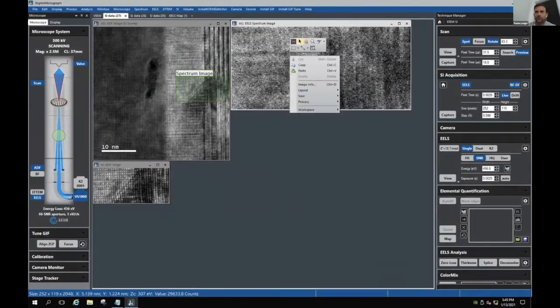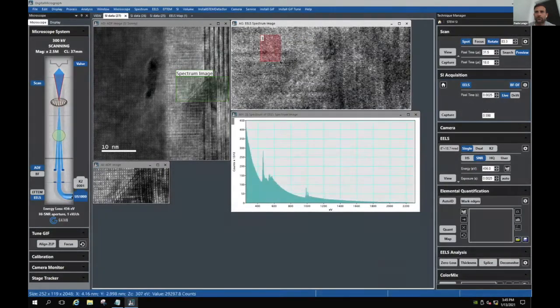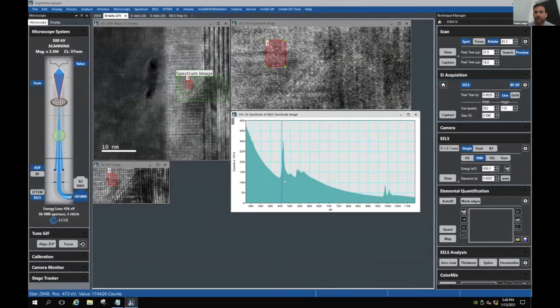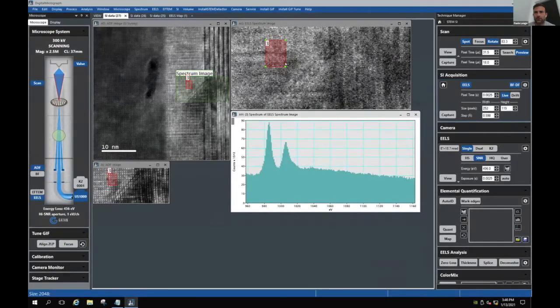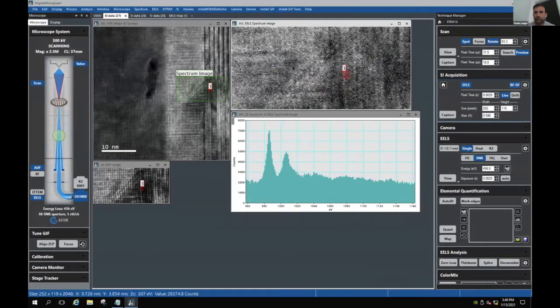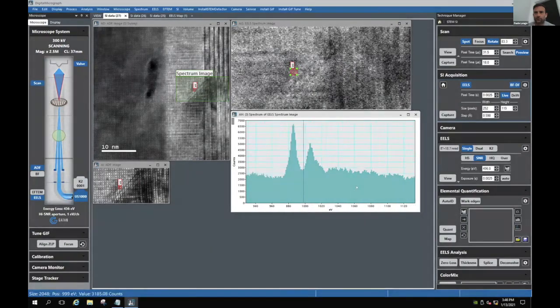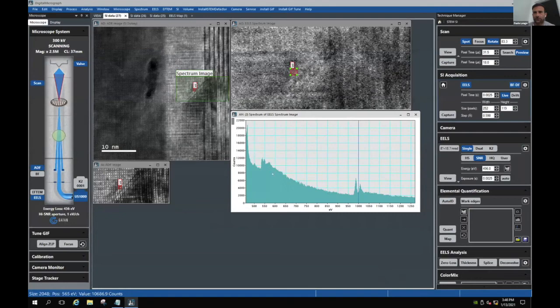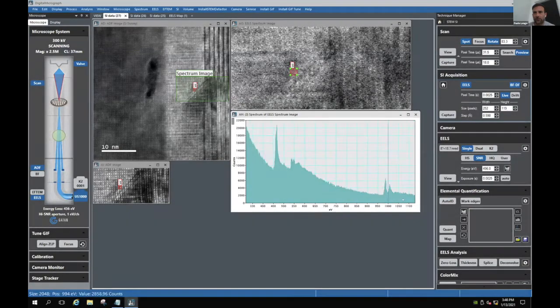So right click here. Again, look at the energy resolution of titanium, it is not very good. This looks decent, but what happens when we go down in pixel? So we are significantly losing a good amount of energy resolution, which might be important for your experiment.